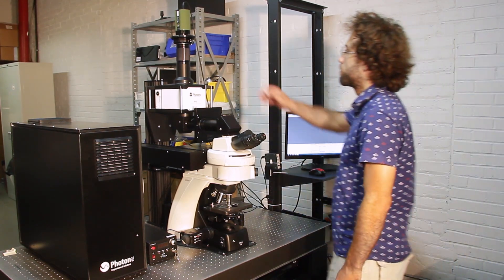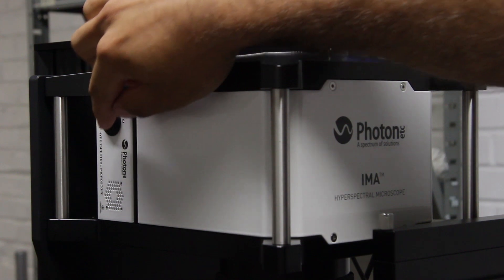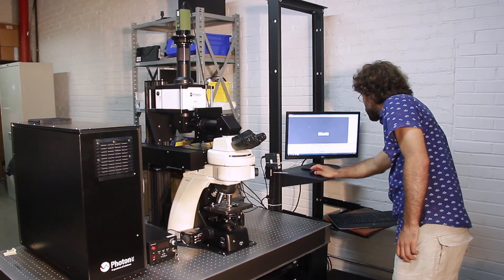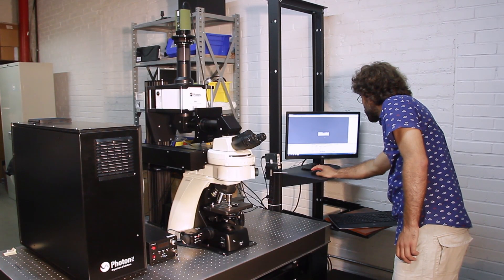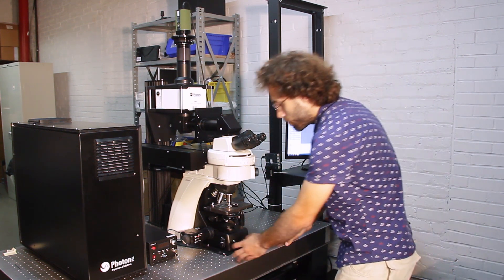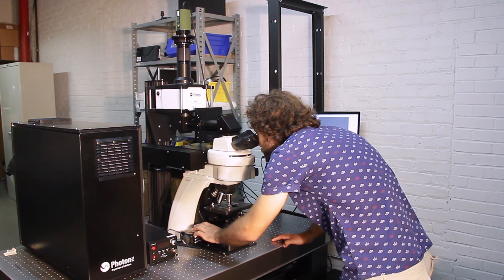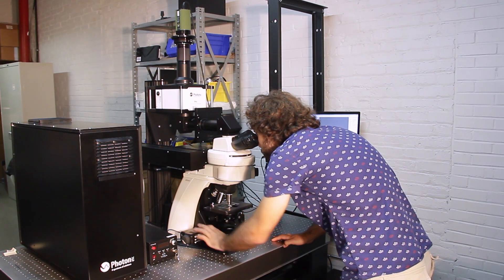Turning on the system is quite easy. You turn on the camera and the hypercube, then sync the apparatus with FiSpec on the computer. FiSpec is Photon ETC's own control and analysis software, which we'll use for today's demonstration. Once everything is turned on and connected, the system is ready to be used.